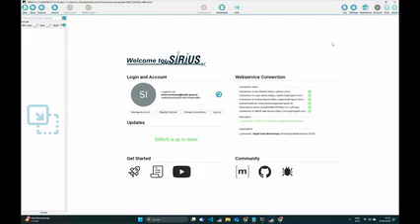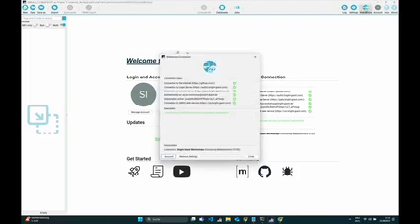If it is not possible, it's also not super important, because most of the examples we will look at, everything will be pre-computed, so we don't have to do any computations ourselves. But if at any time you're using SIRIUS and you see that something doesn't work, it's always a good thing to check this web service tab. So if you click on web service here and make sure that there are always green arrows, so everything works and you are connected to the internet and to the servers and everything.